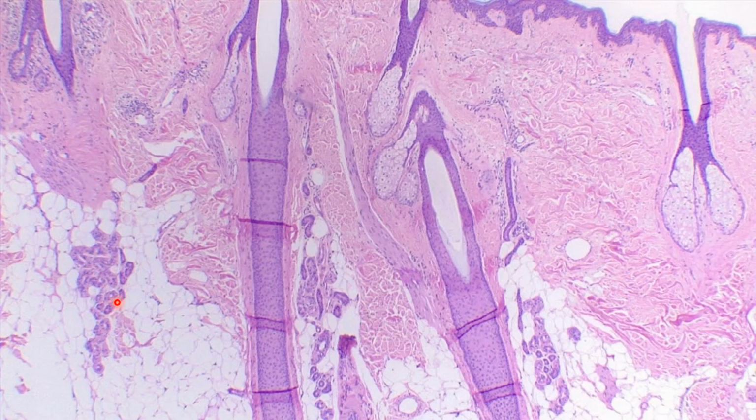You see these weird little structures right here. These are actually those eccrine and apocrine glands. Those are sweat glands that you find. Do you see this little pink river? It's like a structure with purpose and it comes off of that hair follicle. So this is the hair follicle right here and it's coming off of that.